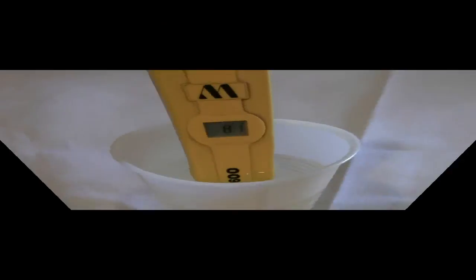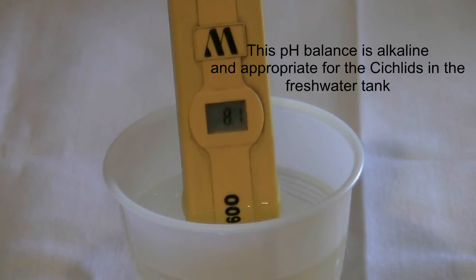The dip and read electronic testers could cost up to a hundred dollars each. They are a little pricey, but each tester can be used over many tanks and last for many years if properly cared for. As you can see, the readout has stabilized at 8.1. The pH level in my freshwater tank is 8.1.